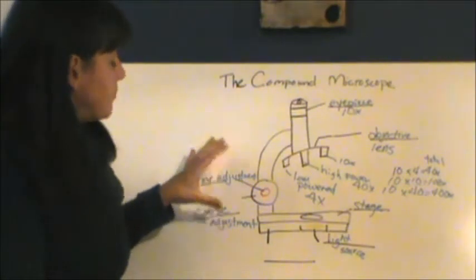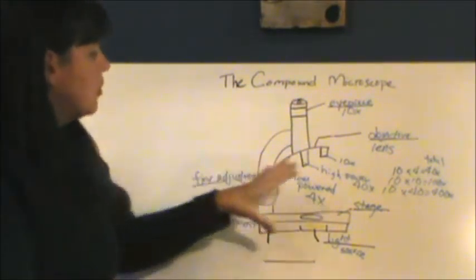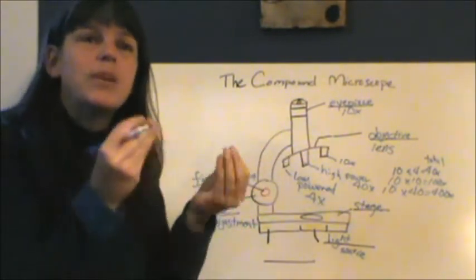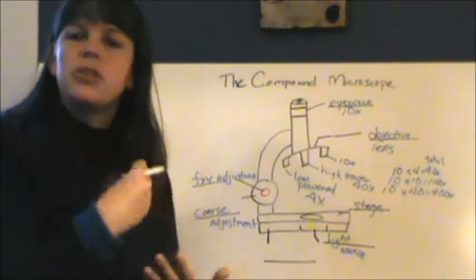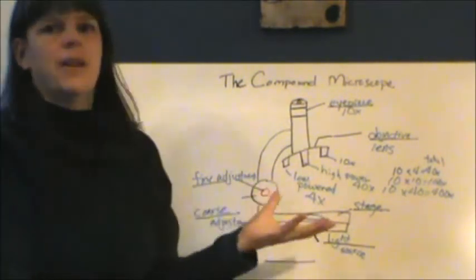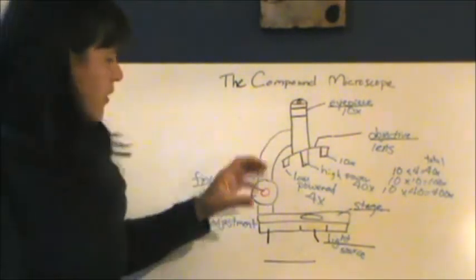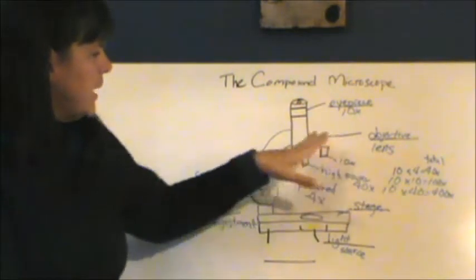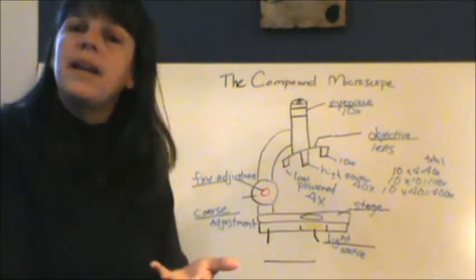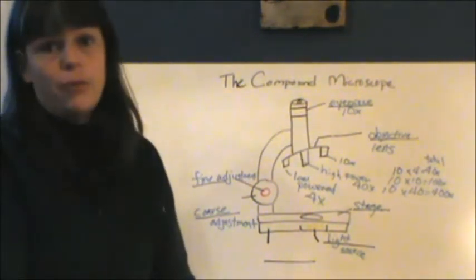When you do that, you are able to get the best picture that you are able to see and really find the cells that you are looking for. And don't worry, when we do microscope work, it's always a little frustrating at first, getting used to how you put this on and use the right objectives and all these tools. That's why we're talking about it right now, but even once we get there, it sometimes can take a little while to find the things you're looking for.